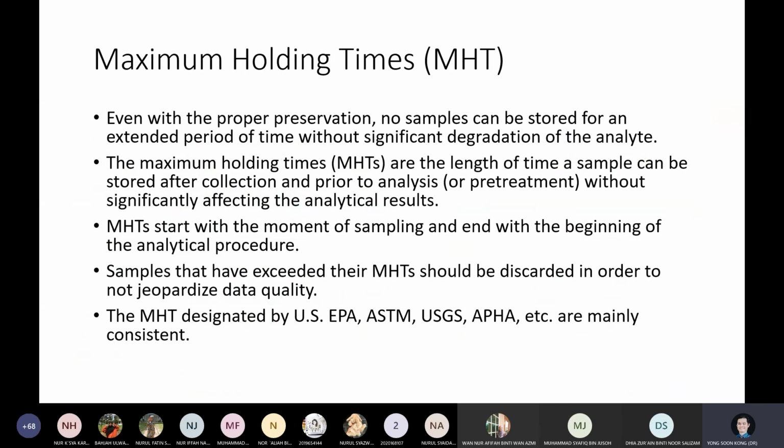So I will come to this maximum holding time before I let you have the 5-minute break. Okay, so let's finish this one now. What is meant by maximum holding time is how much time you have after sampling before the water sample goes bad. After you collect the samples with the proper preservation and containers, some of these water samples might not last the same time as the others, simply because the contaminants are different.